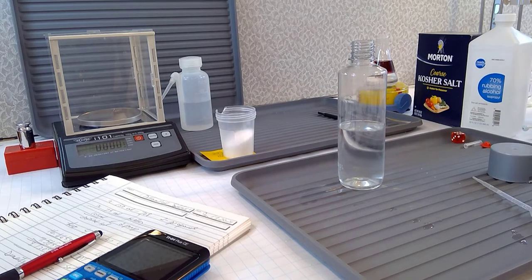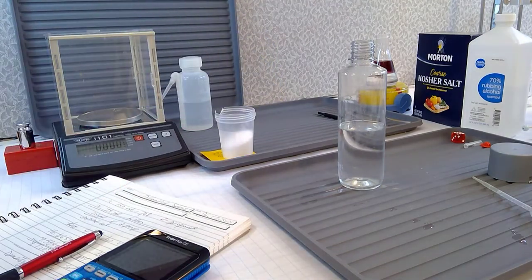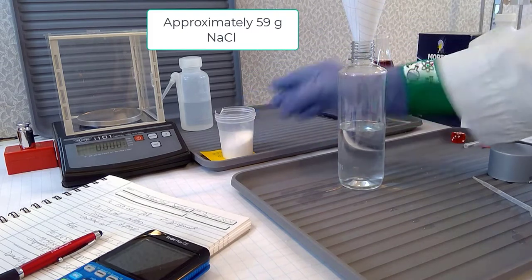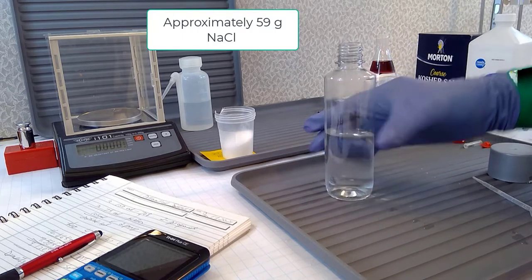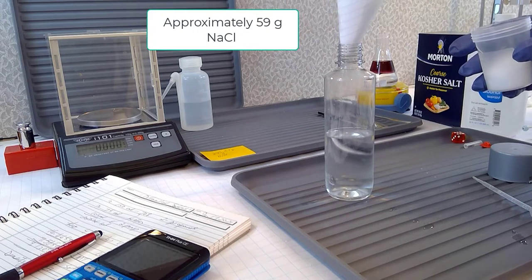And I'm going to add about 59 grams of salt to it. That's way more, I mean, that's quite a bit of salt. We're talking, I think, Alexa, how many tablespoons in 59 grams of salt? Here is what I found. 59 grams of table salt is equivalent to about 3 1/4 tablespoons of table salt. Okay, 3 1/4 tablespoons, a good month's supply of salt.